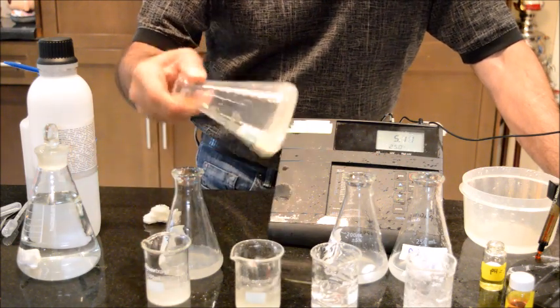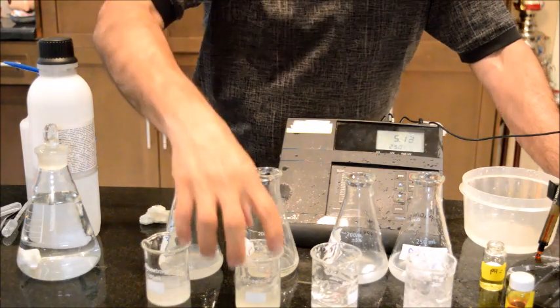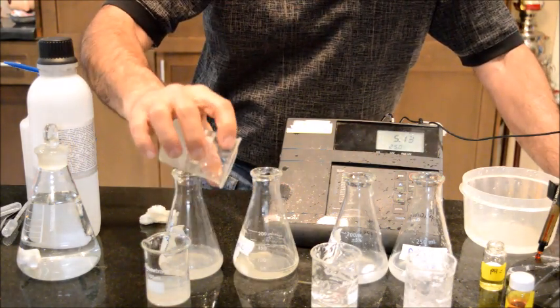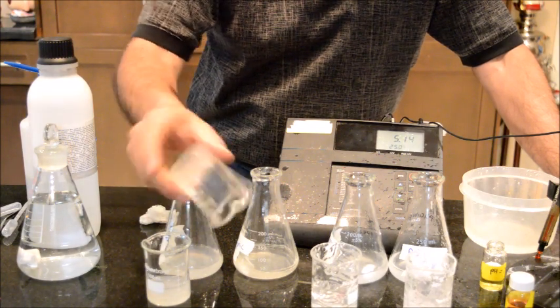Sodium alginate is very viscous. It was the highest when the pH was not adjusted. Now again, pH is adjusted. Viscosity is definitely more than Xanthan gum. It's not even coming out of the beaker.